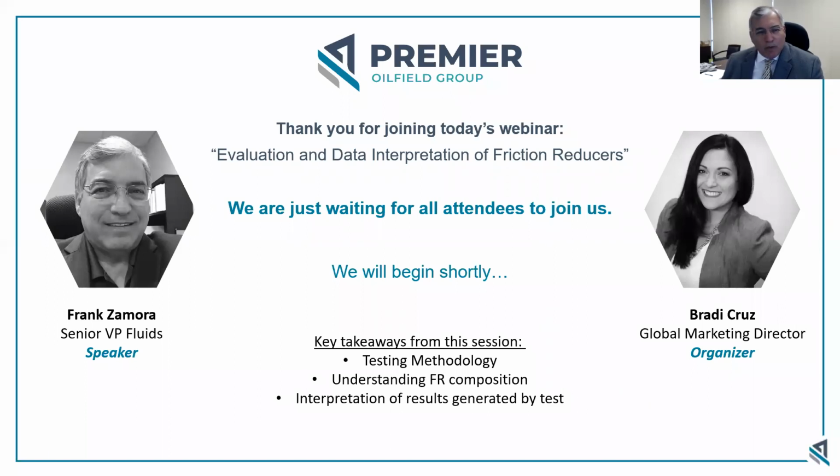We want to share information on some of the things that we've learned and some of the methodology that we've learned along the way over these past 4 years in testing and evaluating some of these FRs. So our goal here, the main takeaway, is to show you our methodology and the capabilities that we have, along with the methodology we're using to evaluate these FRs, and then go through how we interpret the results to better select FRs.